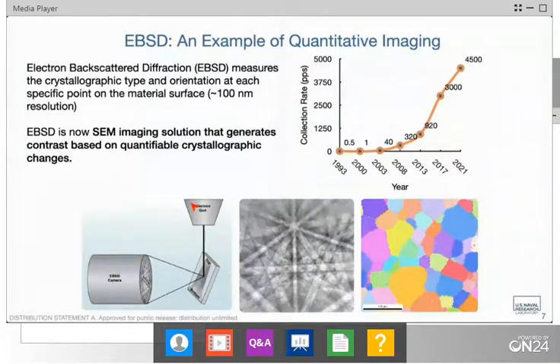And so now we have an imaging method that is extremely easy to segment. I have a quantitative measure. I can say I want to have a misorientation gradient no more than this amount, say 3 degrees, right? And then that's going to label any kind of grain boundary within there. Any points that are within that threshold all become labeled as one single grain. And we know that that is directly tied to properties that we see as being important. So that's why EBSD is so critically important.